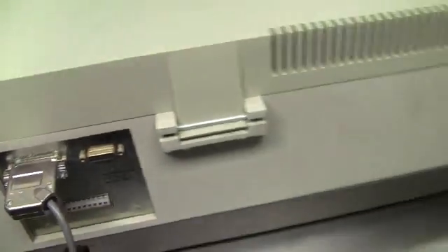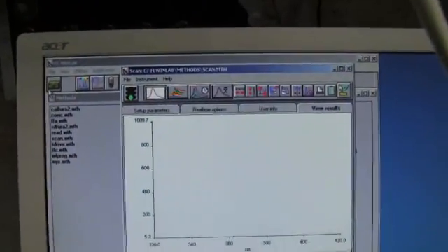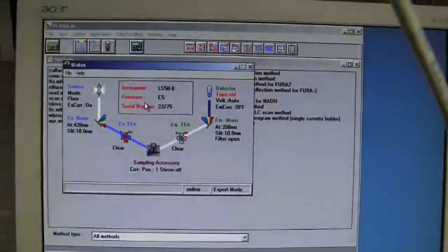It's controlled by Perkin-Elmer FL WinLab. As you can see here, we're connected to the instrument.